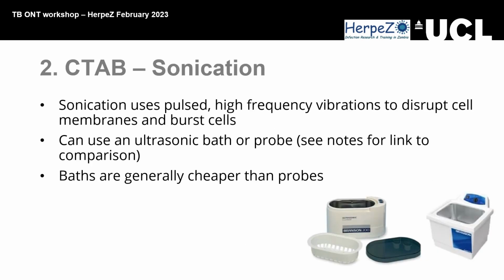So, sonication. Basically what we're doing is disrupting the cell wall to get enough DNA to come out of the cell using sonication. Yeah, we do this for 15 minutes, which is a very long time.